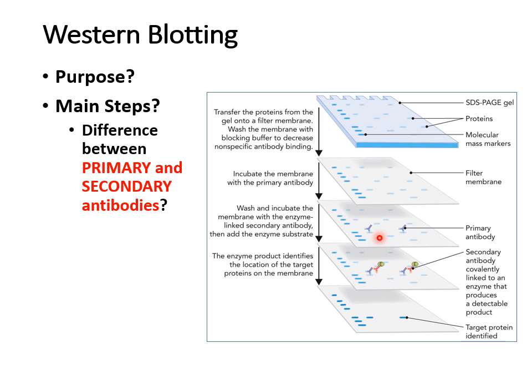When you hear primary antibody, that is a specific antibody that's protein specific. For instance, if you are looking for a tau protein, tau being related to Alzheimer's research, you would have an antibody that specifically binds to tau and only tau.